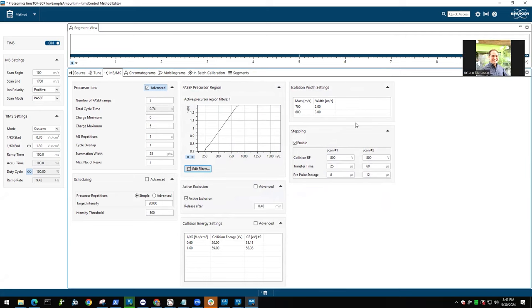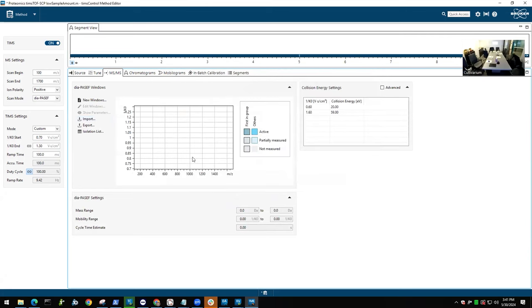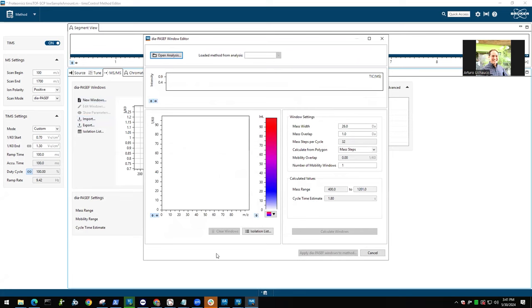For DIA, it works slightly different. We have different modes. So let's just switch to a DIA method. Okay. Not optimized for it, that's why I was complaining. You can either use this.